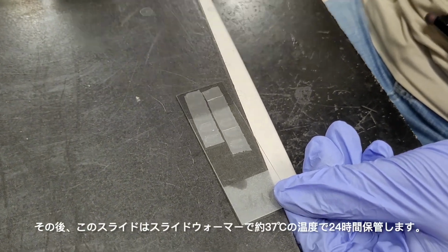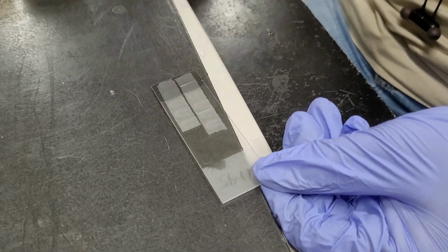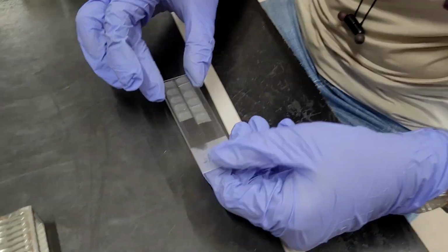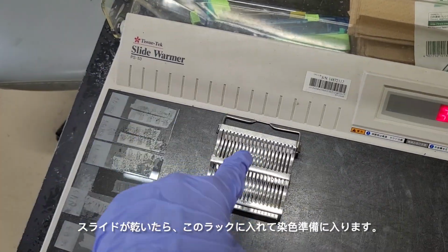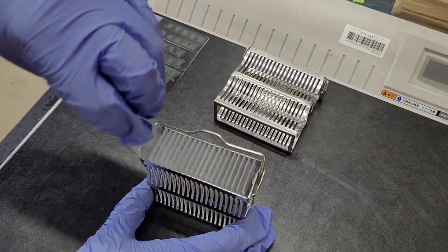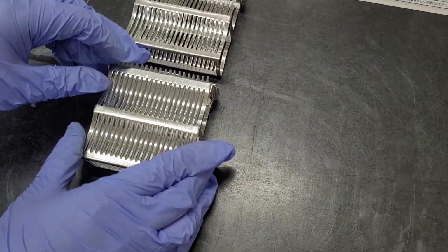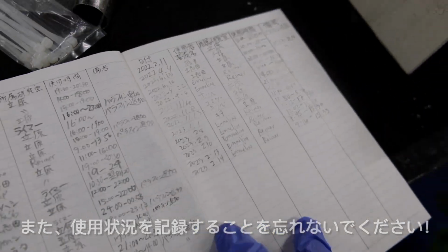These glass slides then remained on the slide warmer for around 24 hours at 37 degrees Celsius, and staining can be performed after this. Once the slides are dry, put it in this rack and we can get ready for staining. Don't forget to write in the notebook after using the microtome as well. So now that we have prepared the slides, we can move on to staining.